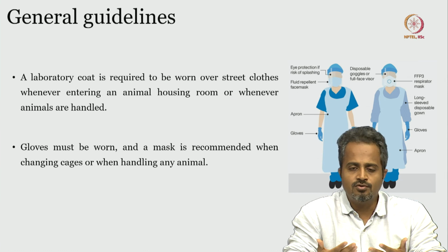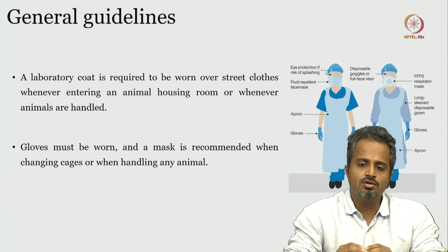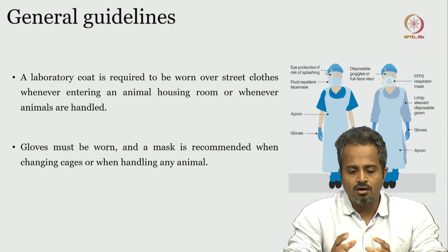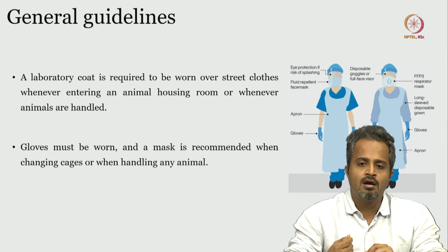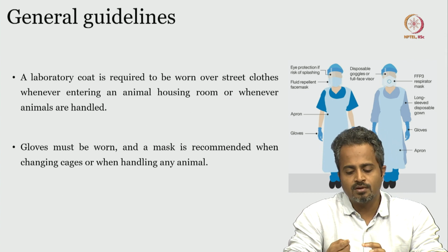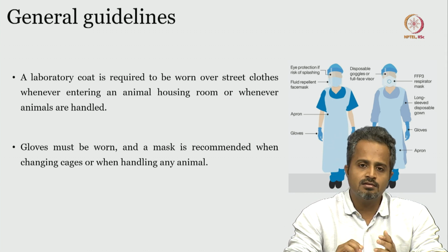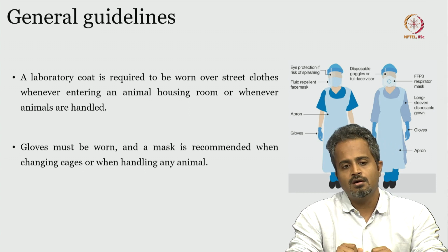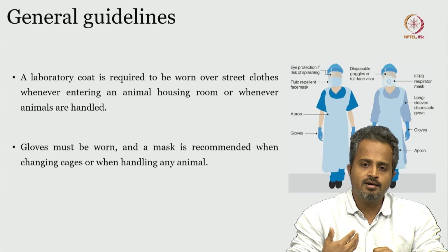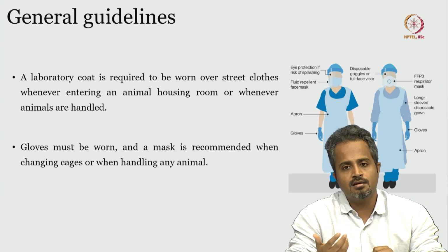So that sort of handling, where you're trying to position the rodent onto your OT table or on the stereotactic apparatus, you're just positioning it, you're trying to shave the hair, all that requires a generally clean lab coat and then clean gloves. That should be followed to prevent your body contact with the body fluid of the rodent or the organisms that the rodent skin can harbor.